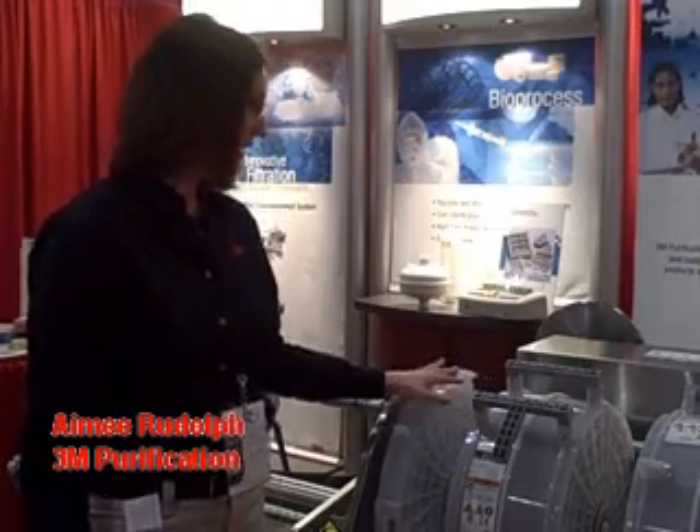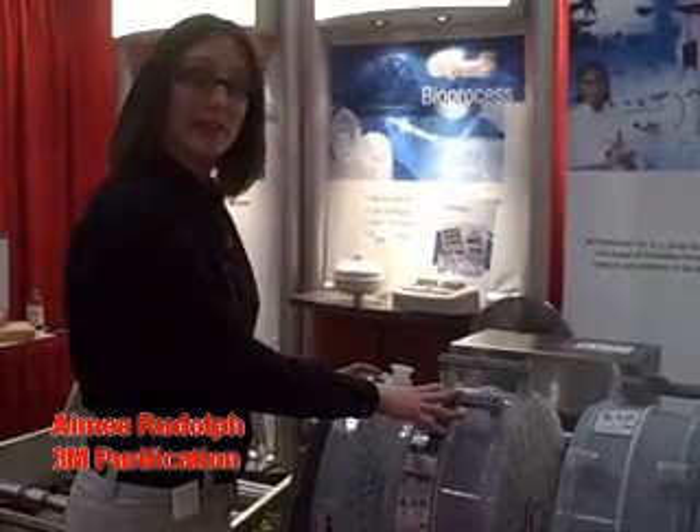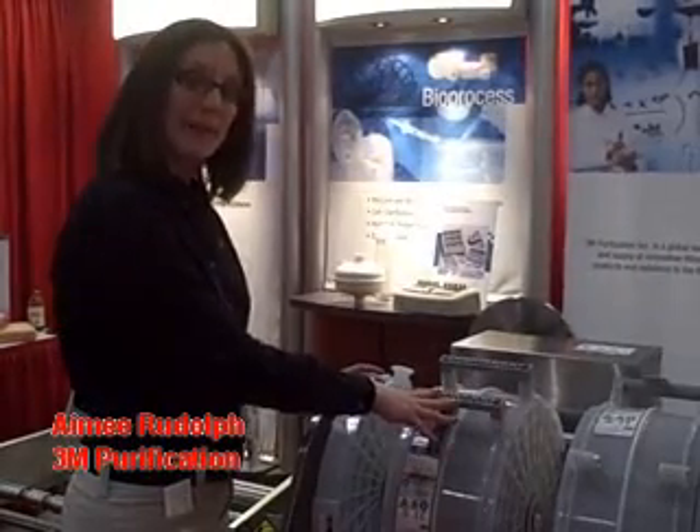Hi, my name is Amy Rudolph and I'm with 3M Purification, and I'd like to demonstrate our new ECP holder. This contains 1.6 square meters of our Zeta Plus EXT depth media.